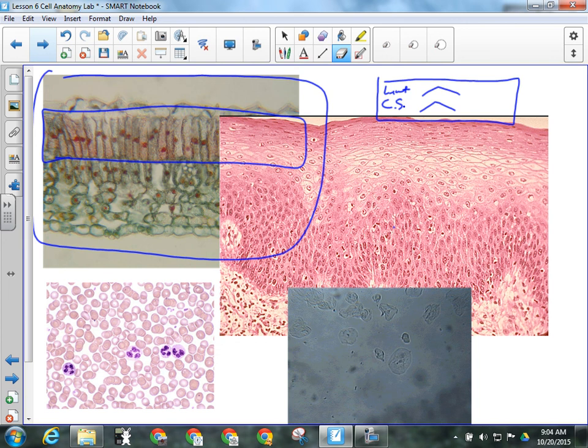Okay, you have to get it as magnified as you can. Look at several other surrounding cells, see if they got similar types of things in them. Okay, maybe one's a little clearer than the other. Okay, but only draw one cell in your diagram. Okay, or if you're taking a picture of it, only label one of them. Okay. All right, so that's what you're looking at for the animal cell.